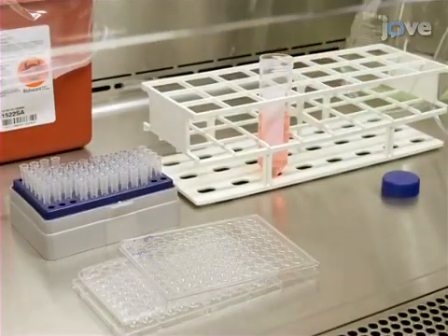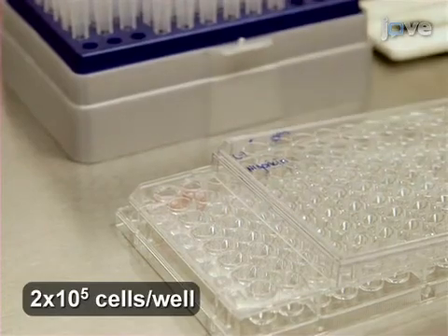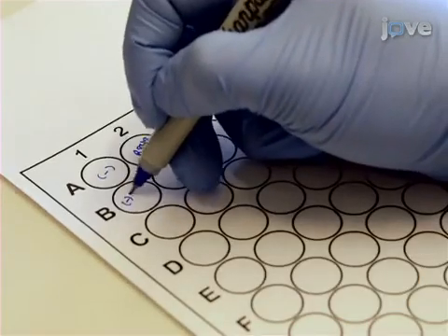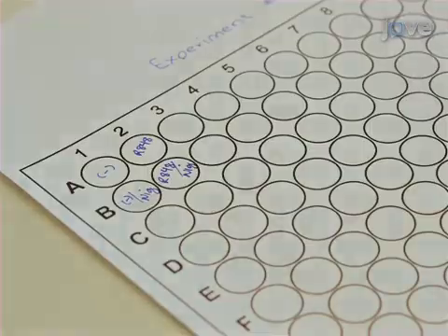Aliquot 200 microliters of freshly isolated monocyte-derived dendritic cells in their resting state in a 96-well round-bottom plate. Start with the four standard conditions of unstimulated negative control, priming only, activation only, and priming followed by activation.